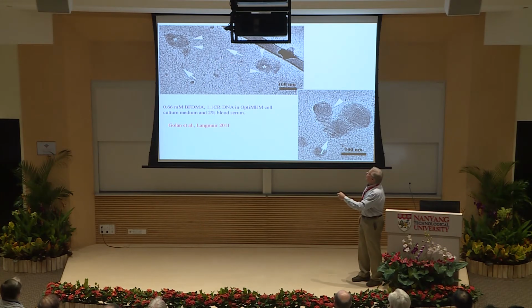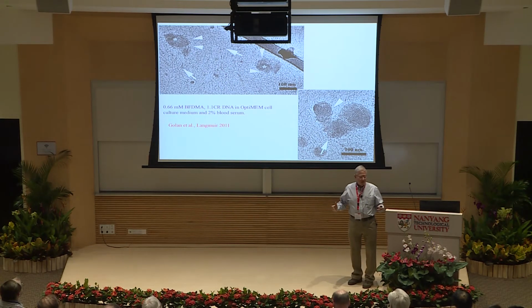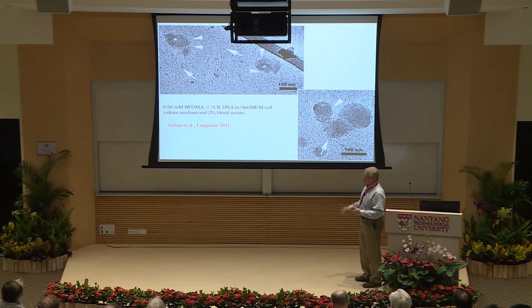All the spaghetti that you see here is actually the free DNA, completely free now. And of course, in the free form, it cannot give you any transfection.